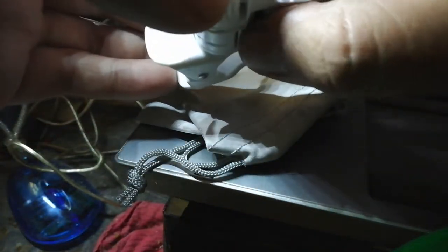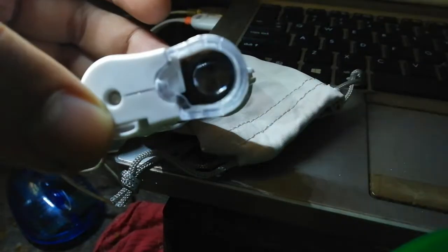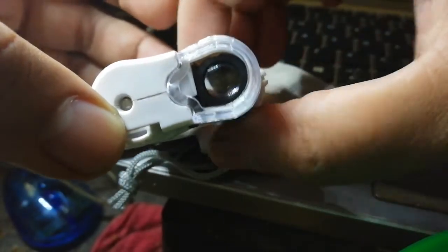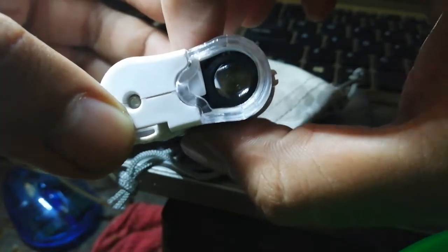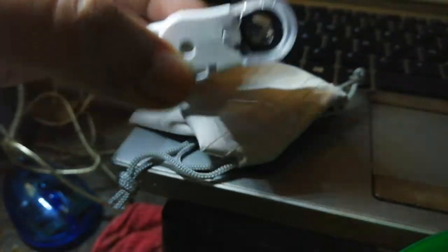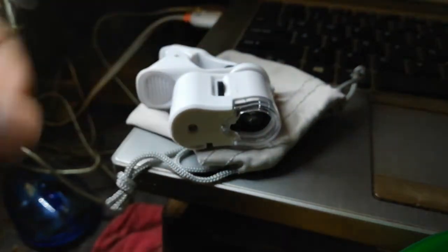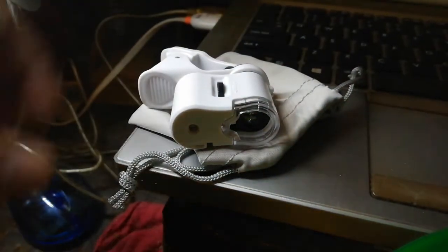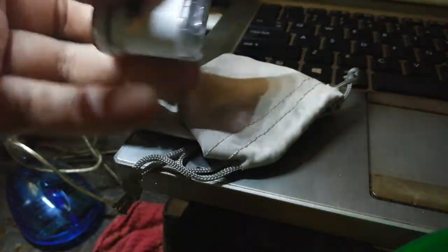And I turn this around, you can see. See that? Do you see that? Wait a minute, let me zoom in. Do you see that? See the element inside moves in order to give you better focus on the thing that you are looking at in the microscope.